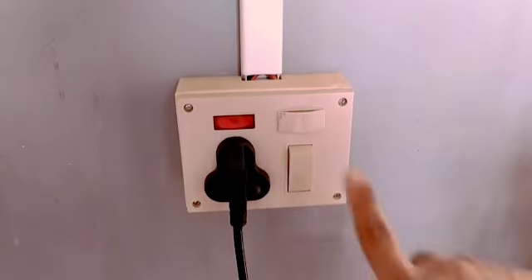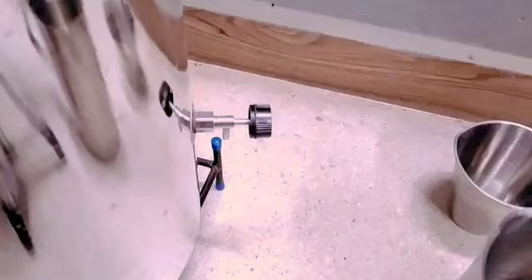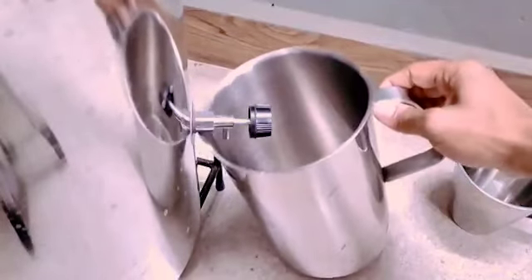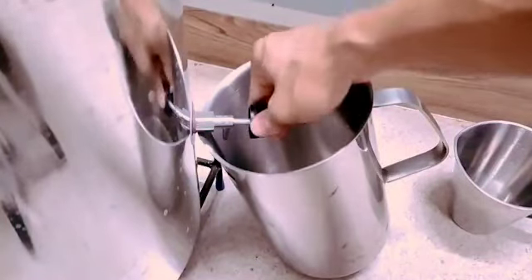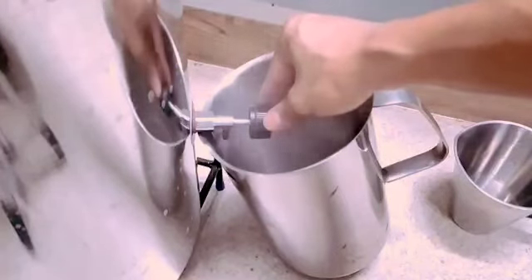At the end of the required time period, turn off the autoclave power supply. Now place a heat-resistant container such as a steel cup beneath the vacuum release valve. Carefully loosen the screw knob to open the valve. A gush of water and saturated steam is released, which will collect in the steel container below.